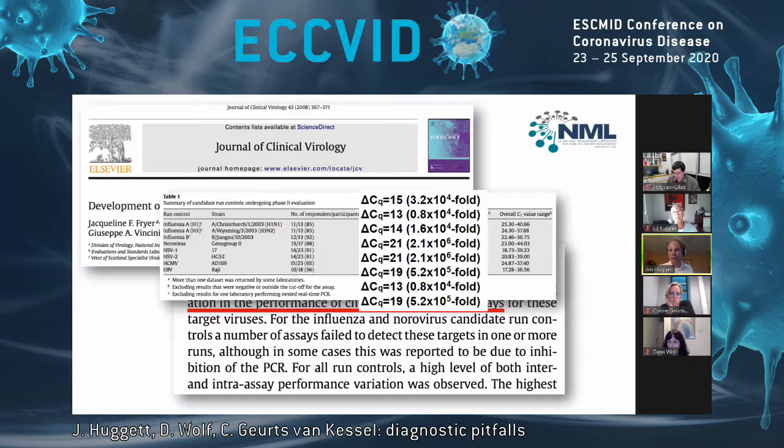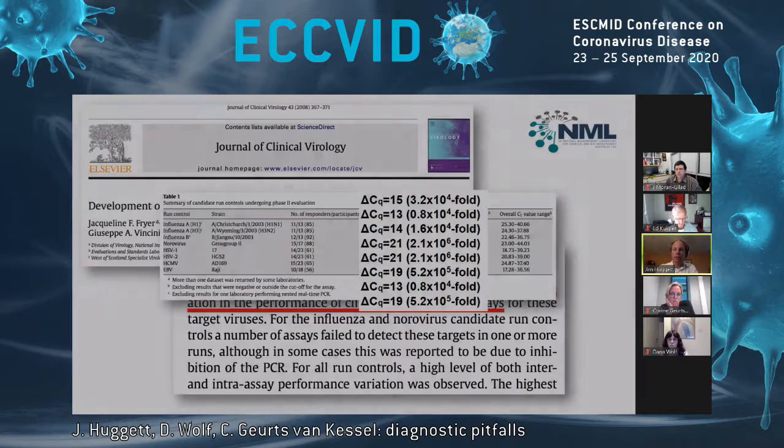We should be understanding this as a community, that just applying a cycle threshold, a quantification cycle cutoff, is going to be variable. You might be able to do it in your particular laboratory with a particular number, but even then it will vary. Different people doing assessments of where you would measure the cycle, it will vary. Even when you're doing the same experiment, you get a new batch of probes in, it's going to move that quantification cycle measure. And so it's a very precise but biased measure. And so we need some kind of calibrator if this is ever going to work.